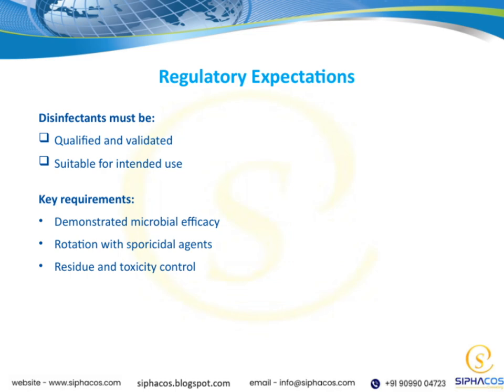Another important point is the rotation with sporicidal agents. This practice helps prevent the development of resistant microbes, ensuring ongoing effectiveness of your disinfection program. Lastly, controlling residues and toxicity is vital. You want to make sure that after disinfection, no harmful residues remain, and that the disinfectant doesn't pose toxicity risks to people or the environment. All these points tie back to our overall goal, ensuring safety, compliance, and effective microbial control in our facilities.